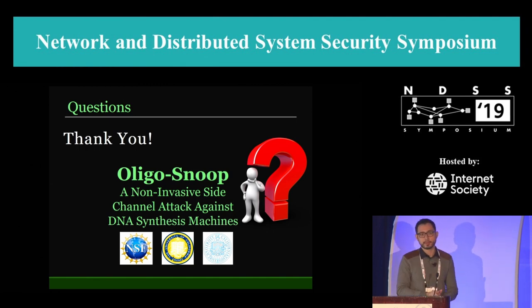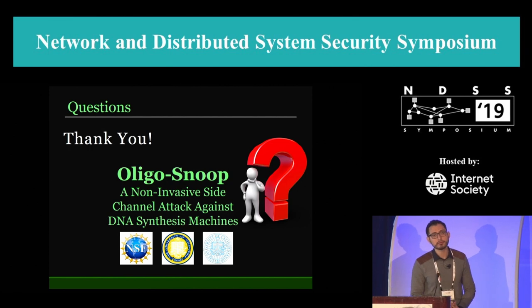Okay, thanks. Hi, Louis from University of Florida. Quick question, do you know how long it usually takes to synthesize the sequence? Yes, and it is very time consuming. For a sequence with a length of like 60, 70, it will take around 6 hours. Okay. And a side question. I know you compared this against a BLAST database. Was that just one sequence that you used, or multiple sequences to check if they actually did match? That was for all the test cases. And in our results, we saw the same results for every single one of them. We had at least one suggestion that was common to the original sequence and the reconstructed sequence. Awesome. Thank you.